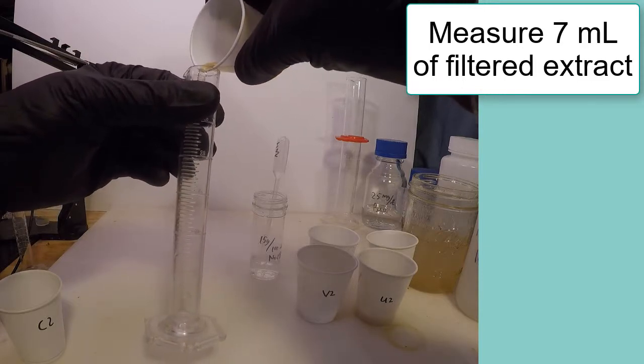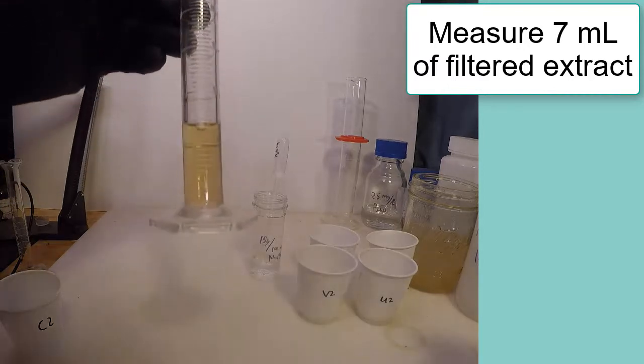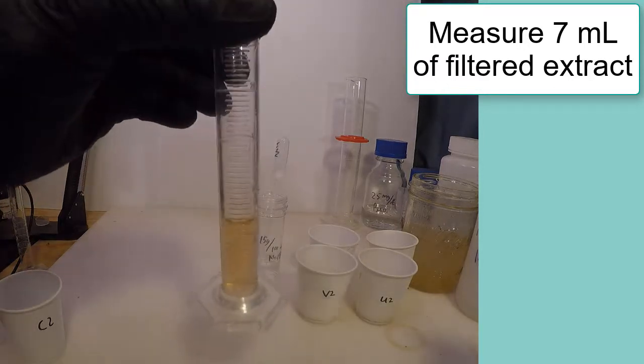The filtered extract has a high or basic pH and must be neutralized using acidic sodium bisulfate or other acid before analyzing.